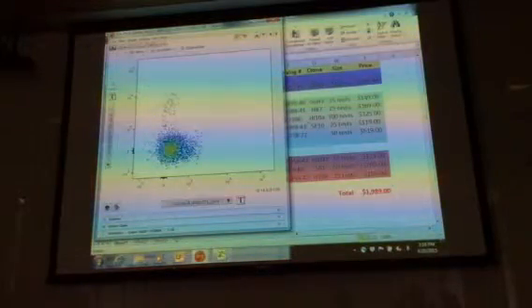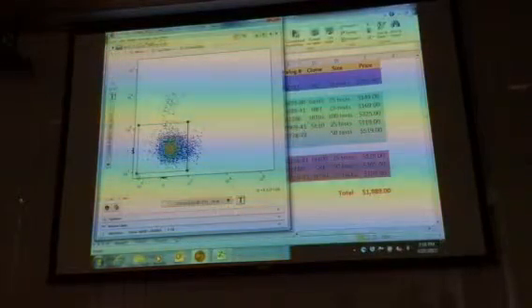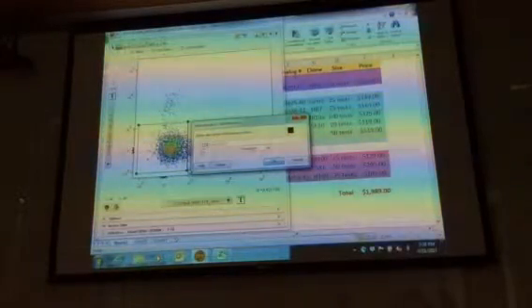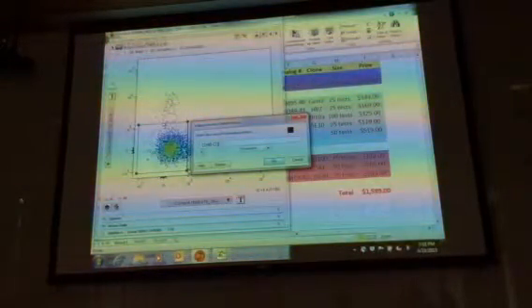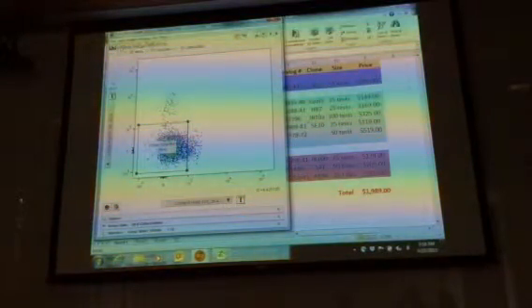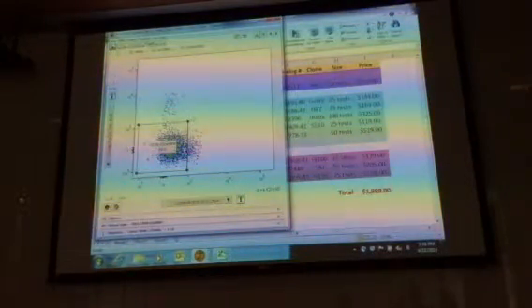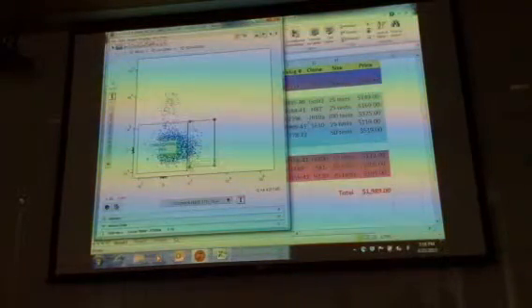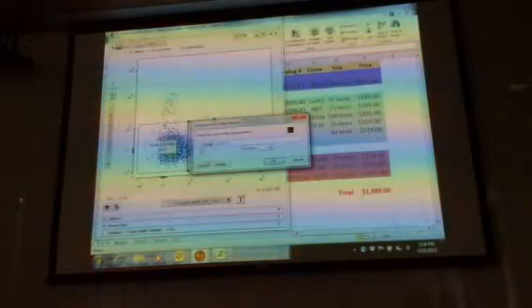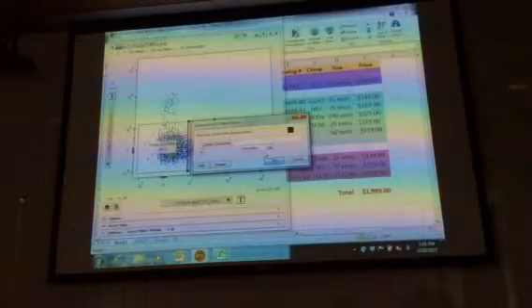So what you could actually do is say, okay, I could draw the gates. So this is my CD90 negative, CD45RA negative. So this is CD90 negative, CD45RA negative. And then over here, you have your CD90 positive, CD45RA negative, like that.